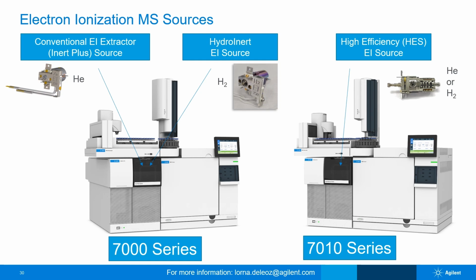The conventional or standard EI extractor source on the left, also known as inert plus source, is a robust and reliable source frequently used for pesticide analysis with helium. The hydroinert source in the middle is available in the 7000 series for pesticide analysis with hydrogen as carrier gas only. It has the same geometry as the conventional EI extractor source. What's different is the level of its inertness.